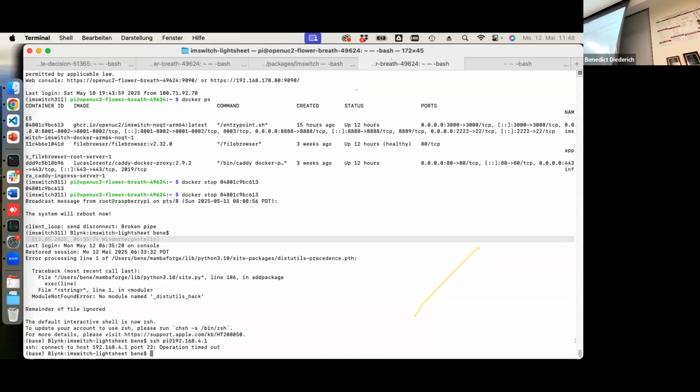What you want to do is actually image in gray. So you can actually cheat and alter whatever you want. You could make that same photo completely different, and then you have an object. DAPI is traditionally stained in blue.